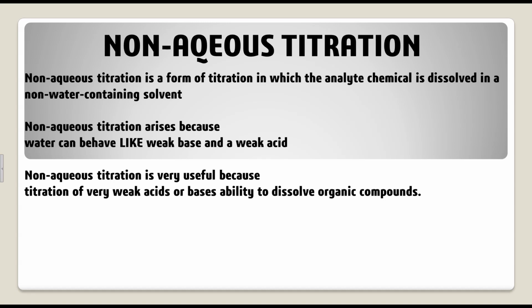And again, this non-aqueous titration is very useful for the titration of very weak acids or very weak bases, and it has the ability to dissolve organic compounds. In such a case, non-aqueous titration plays a major role. That is the main motto of why non-aqueous titration arises.